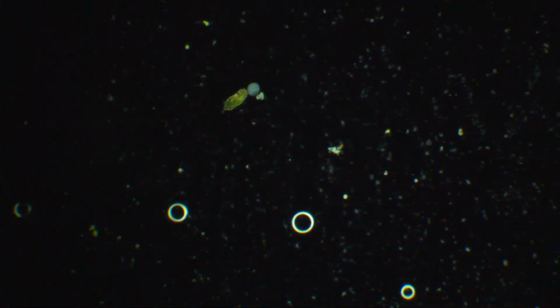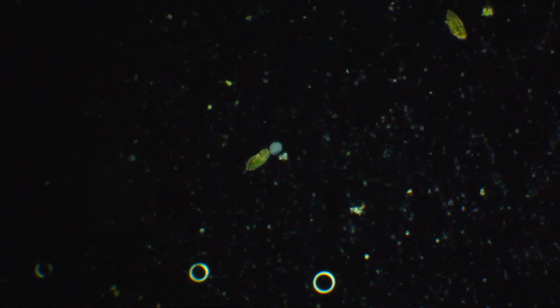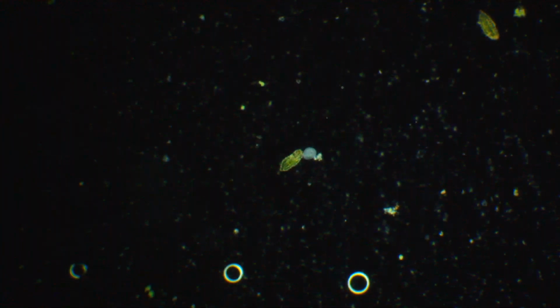And I think I need to adjust my light a little bit. Let me move this over here, and there we go. So I was hoping to find some rotifers in here. If we don't, we can always try again. Here's a little guy. Here's something we can look at, since he's just sort of staying in one place.